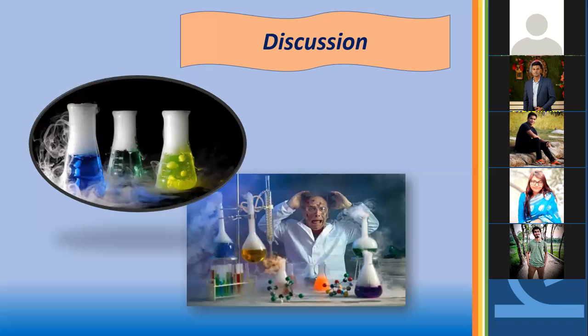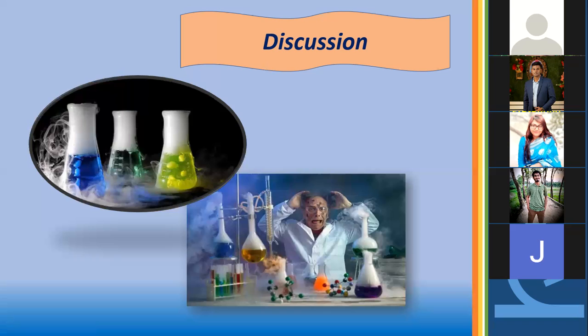To do any experiment, we need to remember some important things. We should always rinse the burette with the solution which is to be taken in it. Every time we should remove the funnel from the burette before noting the readings of the burette and ensure that no drop is hanging from the nozzle of the burette. When we want to note the burette readings, we should place the eye exactly at the level of the meniscus, because it is very difficult to determine the endpoint accurately. This is one of the main reasons for error.